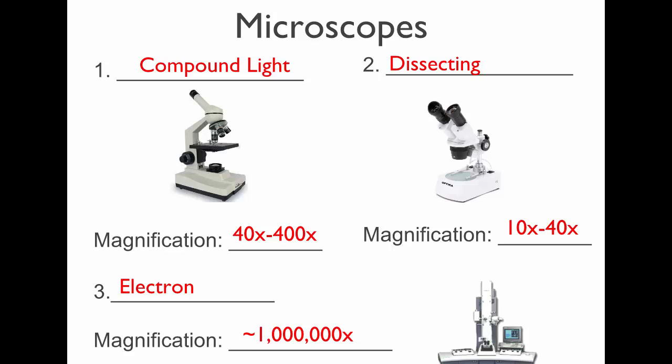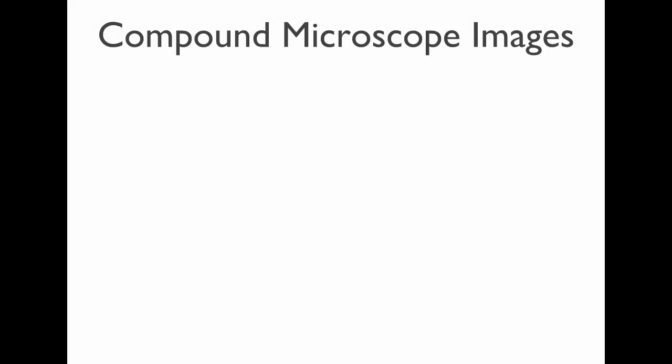This is one of the things I brought in to look at in the electron microscope, a little feather from an owl, and we zoomed in on a certain part. And these are all the fibers that make up the feather of the owl. And so this is not magnified all that much. This is 1,500 times. So we could have zoomed way in on this, but we wouldn't really see all that much, right? Because there wasn't that much detail in here. So this electron microscope can really give you great resolution. I'll show you some more pictures from that microscope in a minute.